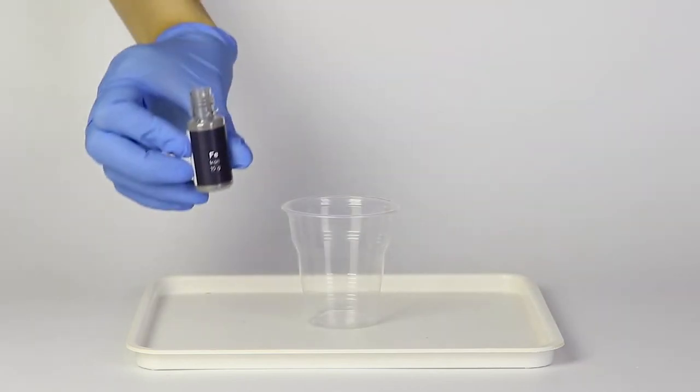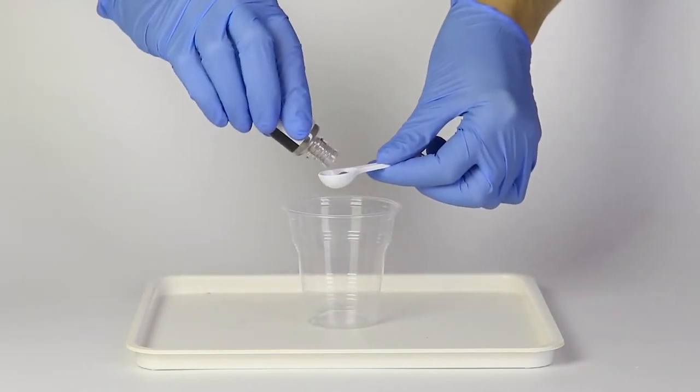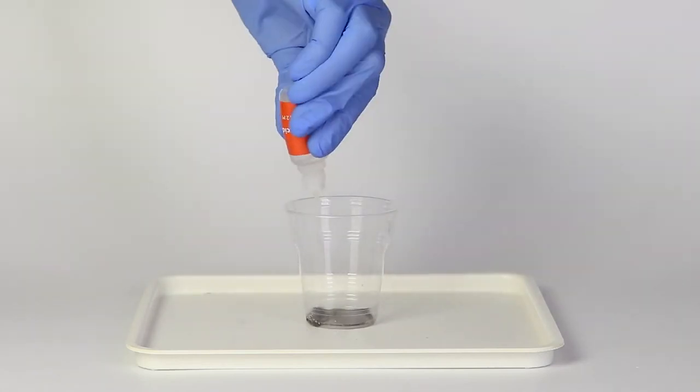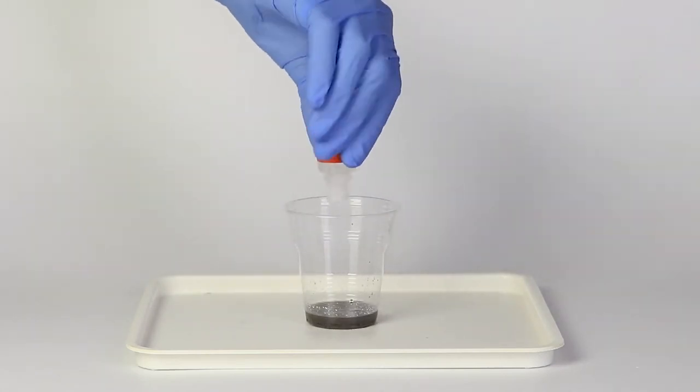Put one big spoon of iron powder into the disposable cup. Then, add one bottle of citric acid and wait five minutes.